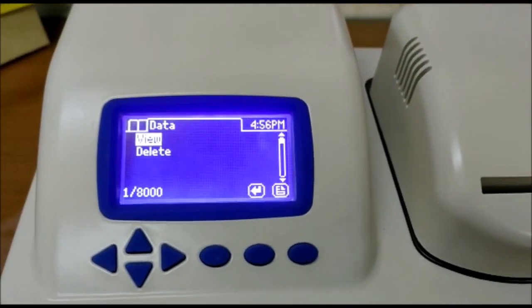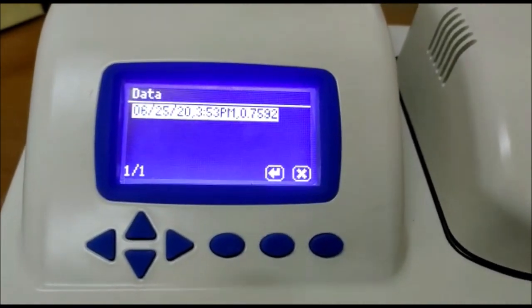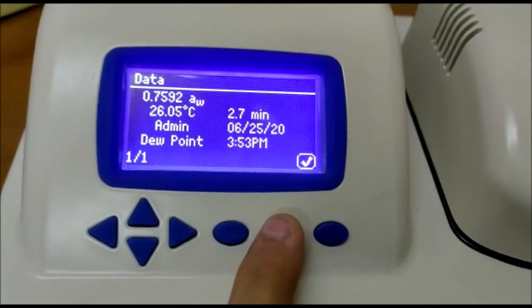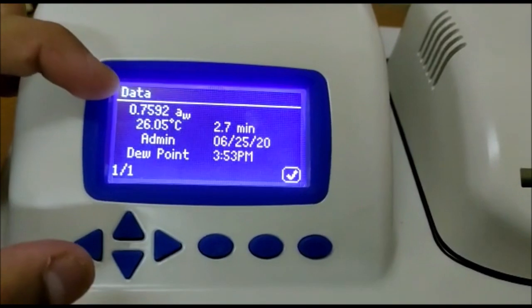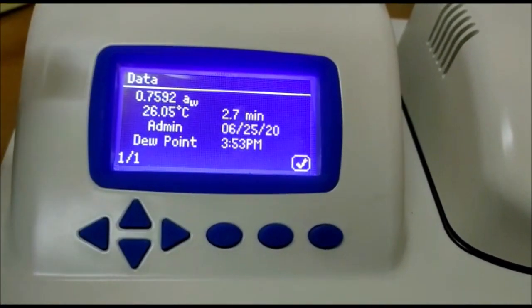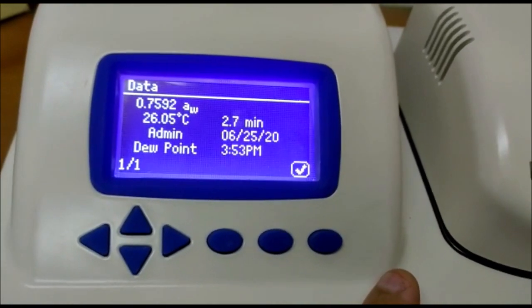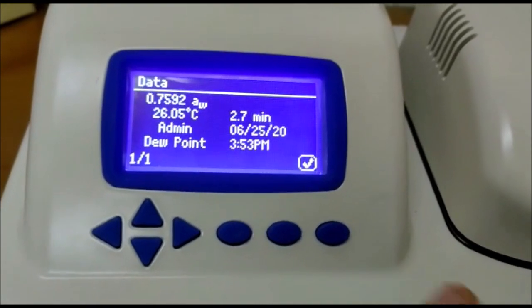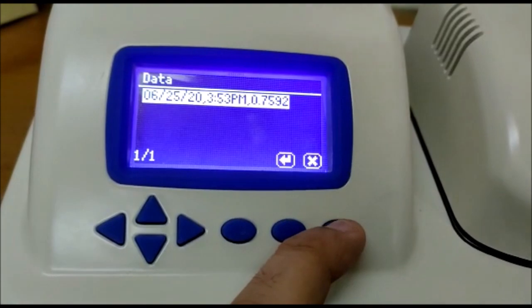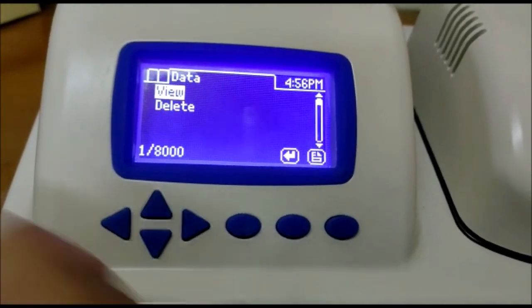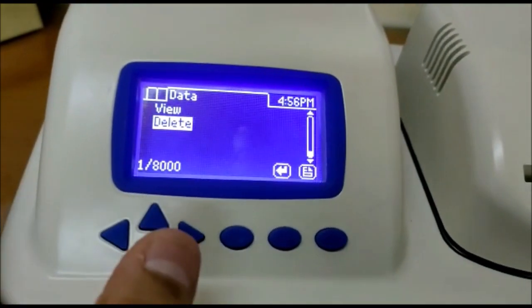I already mentioned that instrument can store 8000 data points. You can view the data date wise. And when you are saving the results, you can add annotations also. Here at the top, it will tell you about the sample which you have annotated during the test. It will give you information like water activity, at what temperature it was tested, test time, who did the test, admin or user, the date and which sensor you have used. And if you want to delete data, just come here and delete the entire data. No one can manipulate the data inside the instrument.